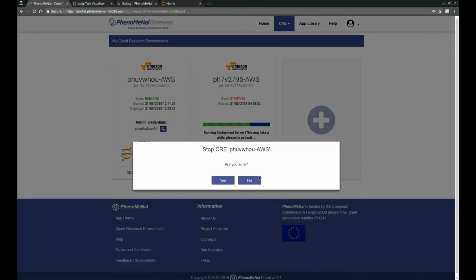Okay, so at this stage, I'm not going to confirm because I'm going to use this later. But if I was to go yes, then my deployment would cease to exist. Okay, so this concludes my live demo. I'm going to switch back to my slides.